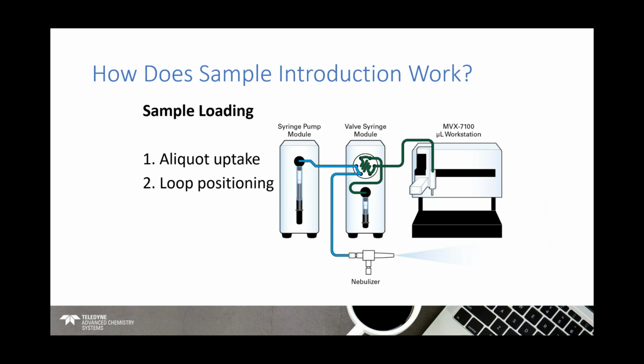So following that, as a hardware tour, how does the sample introduction process work? It's actually very simple. I've pretty much alluded to it as we go through, but I'll just walk through this again. There are 2 stages: a sample loading stage and a sample introduction stage. We've got 2 flows going on at any one time.